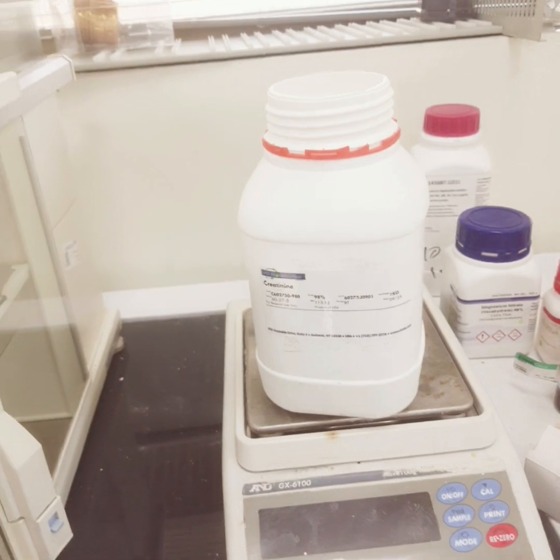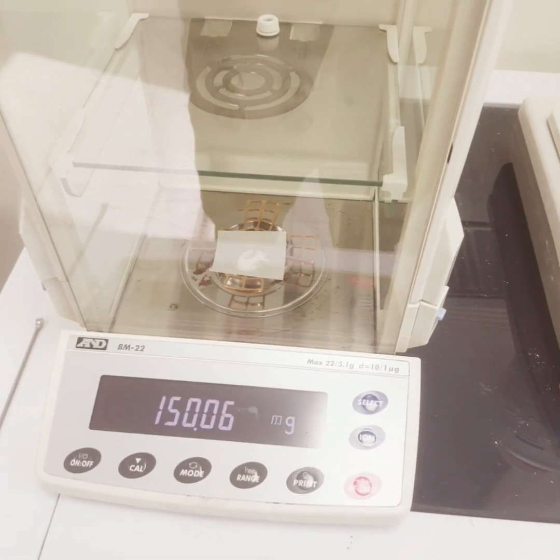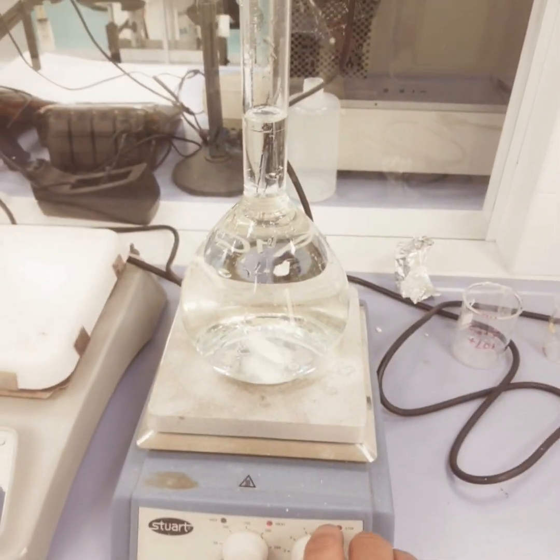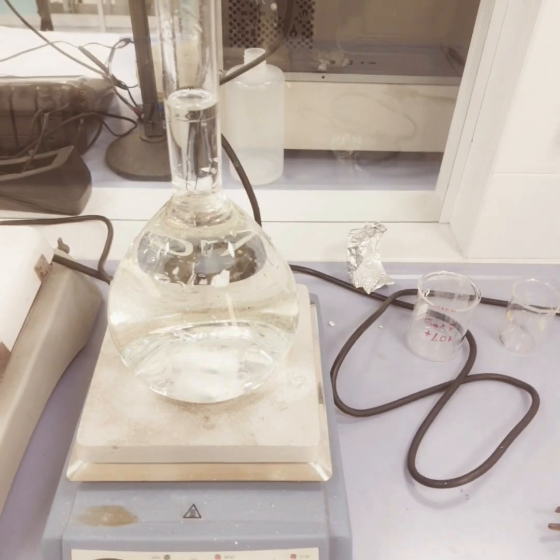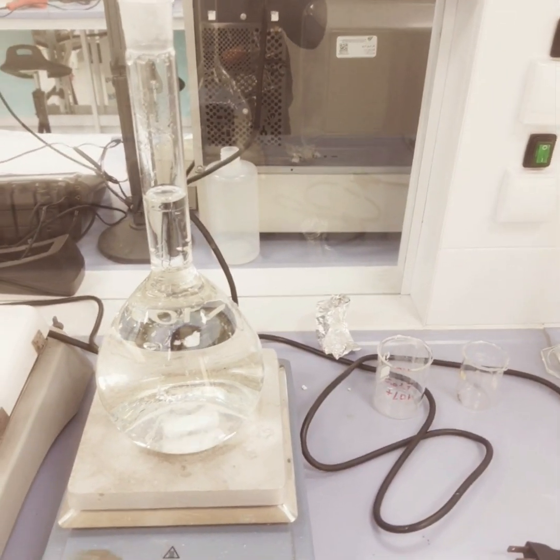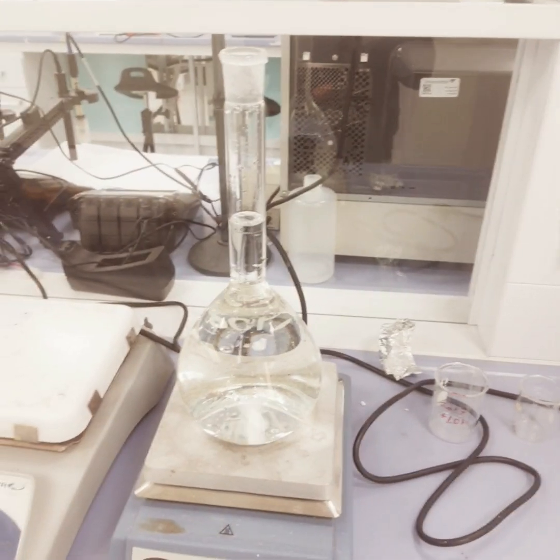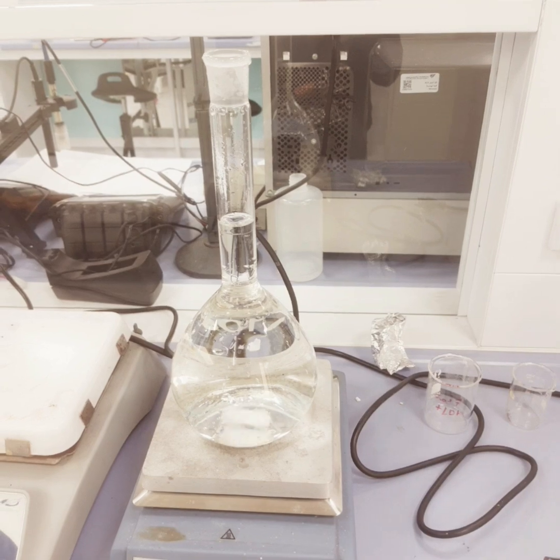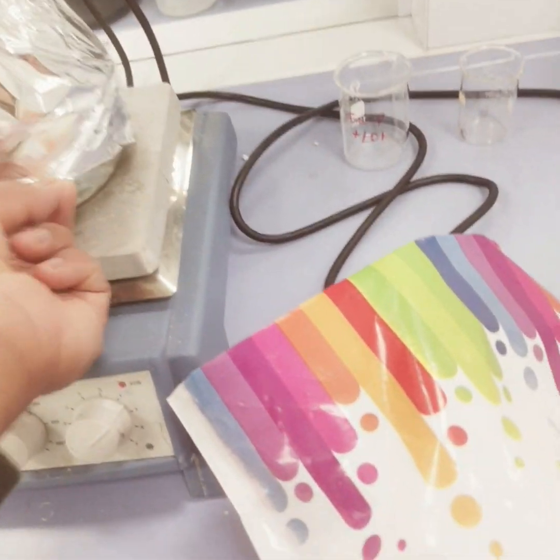Now let's learn how to dissolve it in deionized water. I've taken around 150 milligrams. Now I will dissolve that in the deionized water. I will dissolve this for a couple of hours. Better is to leave it overnight. And I will also cover this with aluminum foil so that it does not degrade with the light or any other kind of light activity. So guys, now the creatinine is fully dissolved.